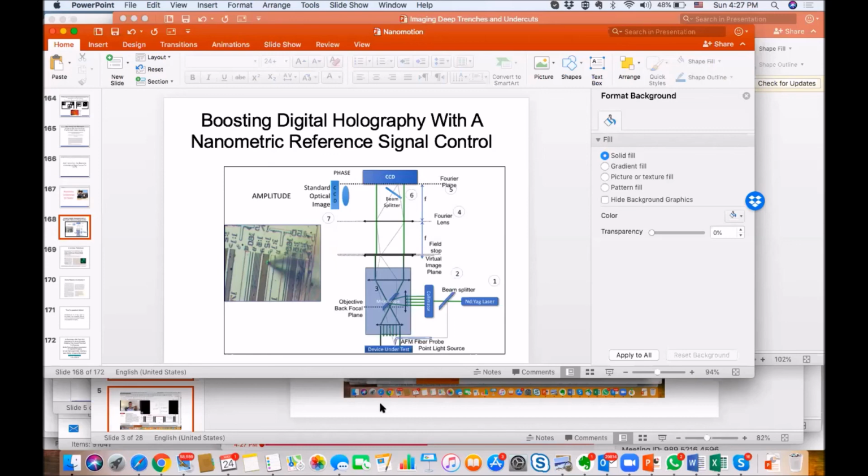What I gave you on Friday are numbers for the custom high-speed flexure, which can do X, Y in 1 kilohertz and Z in 10 kilohertz. Basically, we can achieve nanometer resolution on unlimited range if the scanning is slow. But I think let's keep it to another discussion, and I think it was extremely informative and enlightening.